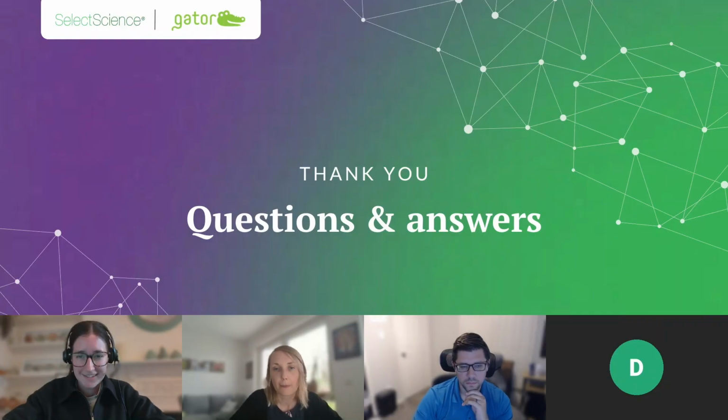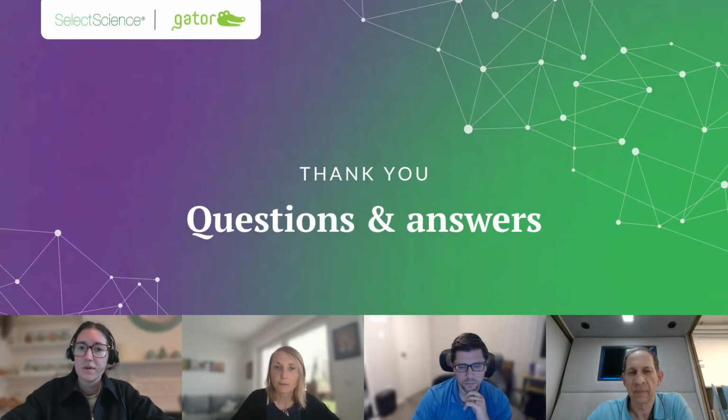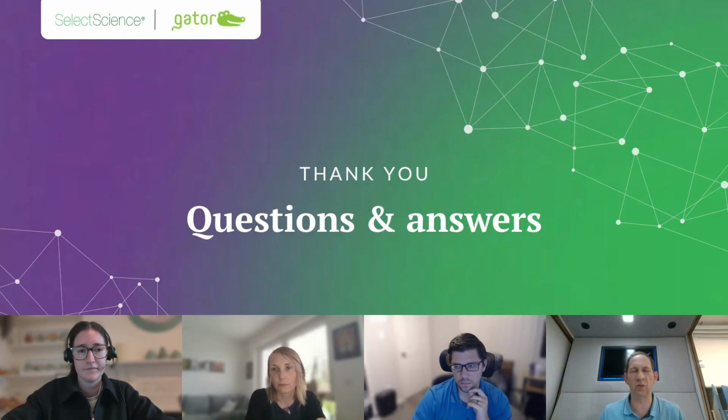That's great. Thank you, Alexandra. The next question here is for Ron. Ron, when looking at the BLI outputs to train the AI, which numbers do you use to refine the AI model? Is it just KD? So I think it depends on what the model is, and people have models with different, let's call it, outcomes that they want to get out of it.